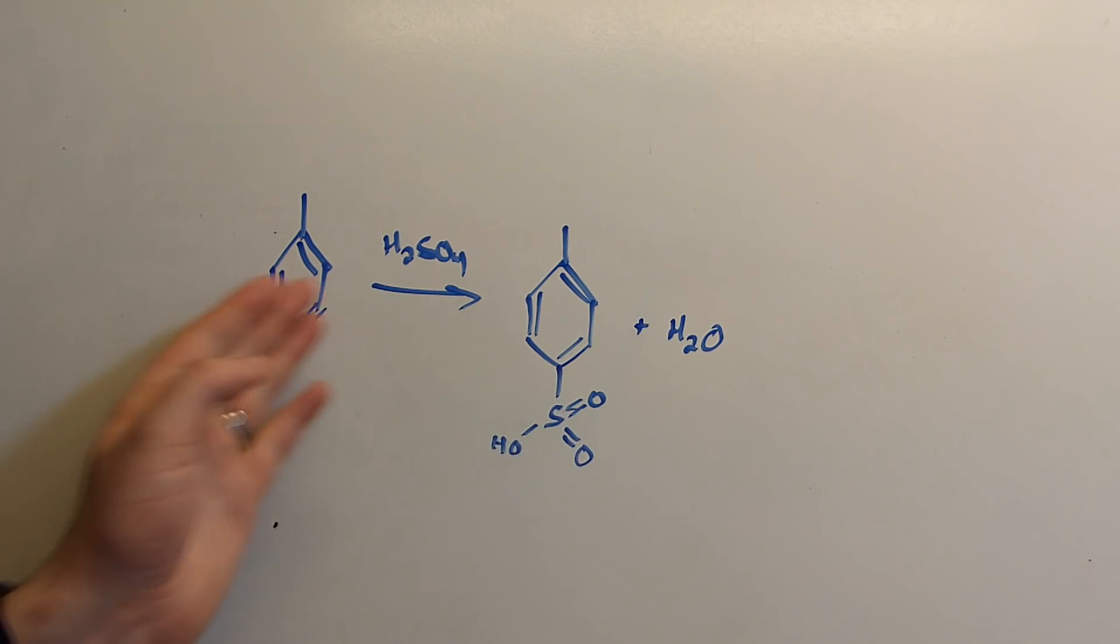This reaction involves an equilibrium between the two sides and in order to drive the reaction and help increase our yield I'll be removing the water from one side continuously. This is very conveniently done because toluene happens to be one of our reactants. A Dean-Stark trap is a specific piece of apparatus that allows you to set up a continuous loop of refluxing toluene which removes water continuously from a reaction.